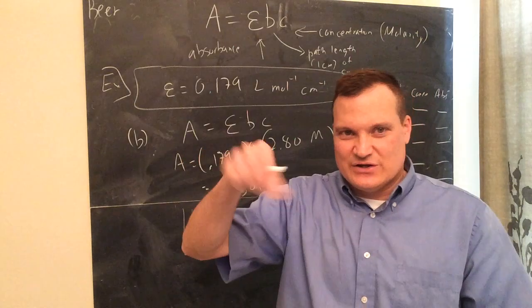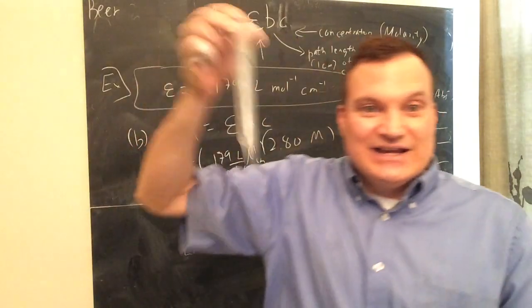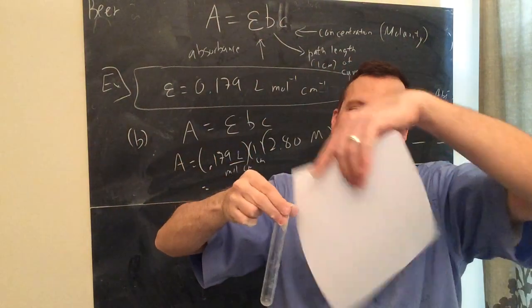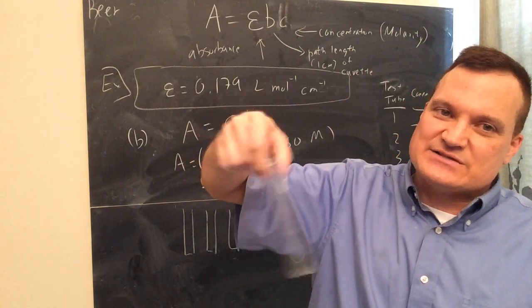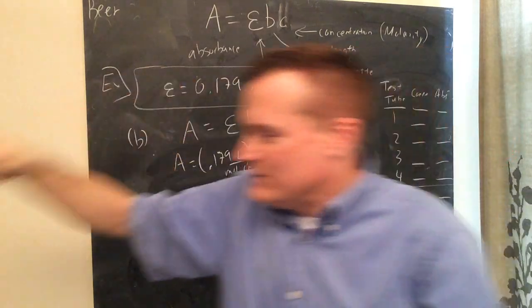Vortexing means you kind of move it around like this. Like I would be vortexing it if I did. Well, I'd hold this one. Shaking it up would be that, and it'll all splash out into the air. Okay. Stirring it would be putting a stirring rod in. We don't want to touch anything inside there; it might affect it. So vortexing just means you're doing this, like a small amount in a big test tube. You're doing that. So you're like stirring it. They call it vortexing. Okay.